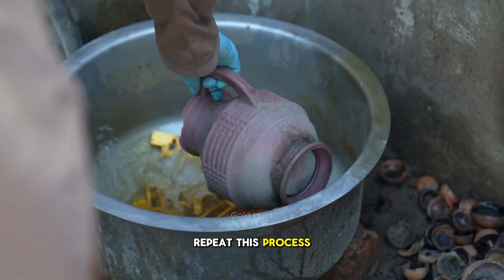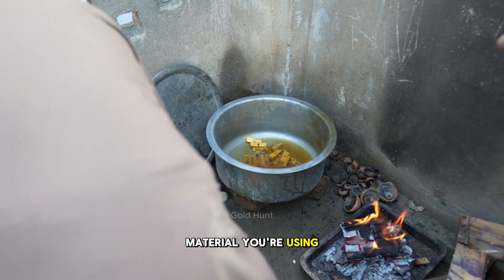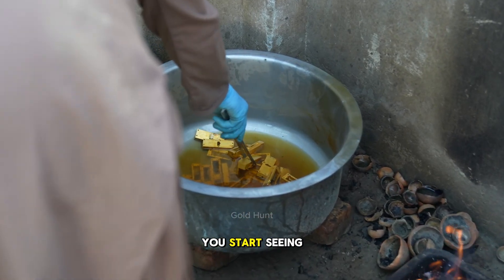You'll need to repeat this process around five to six times, depending on the material you're using. Continue this until you start seeing the gold.